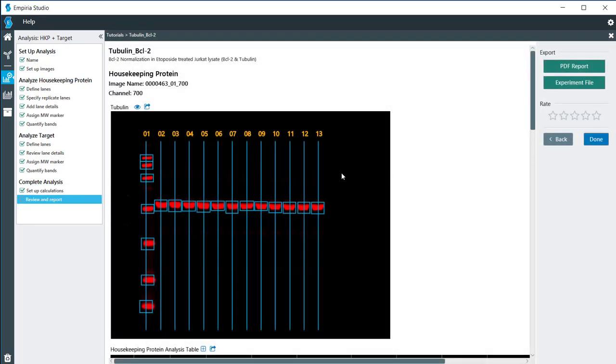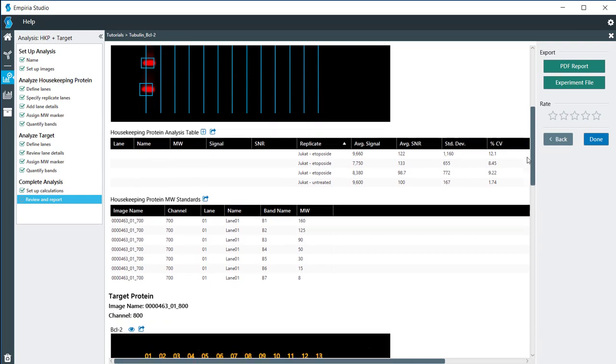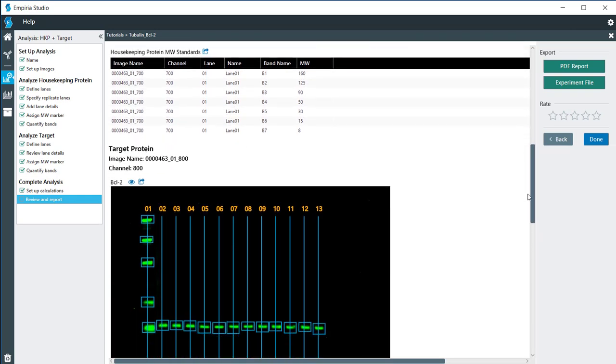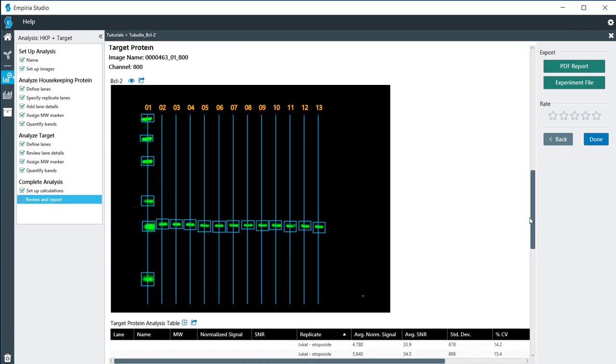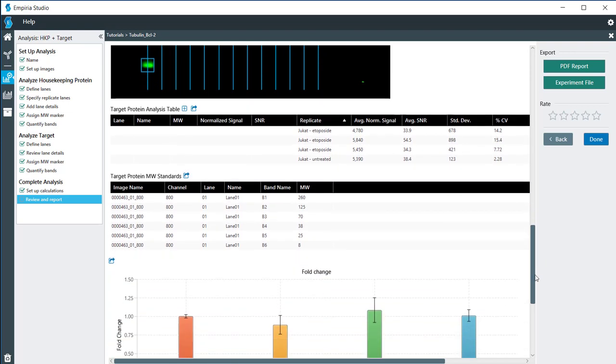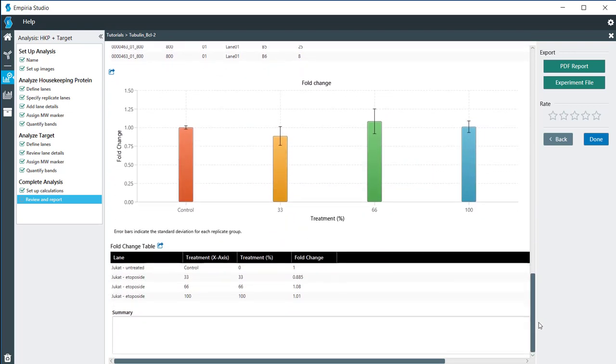From there, we can review the data. I have my loading control here, my housekeeping protein, tubulin in the upper image. Then I have all of the data tables loaded underneath it, along with the target protein, and also its data tables and the charts all in one location.